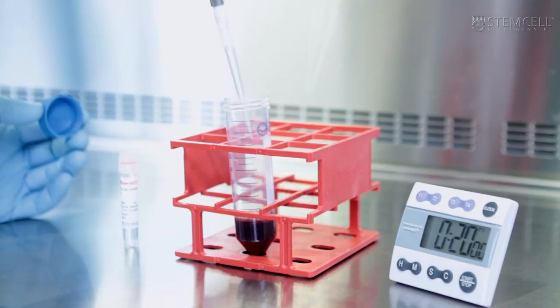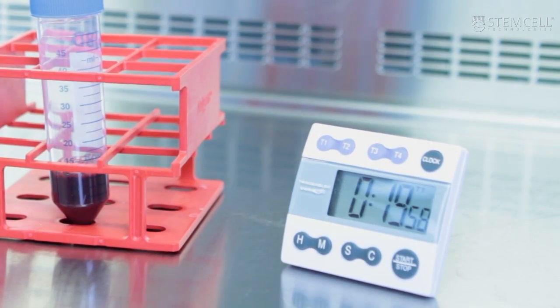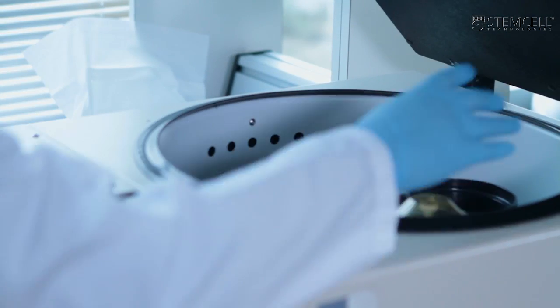Simply add the appropriate RosetteSep cocktail to your blood sample and incubate for 20 minutes at room temperature. Then perform a standard density gradient centrifugation.